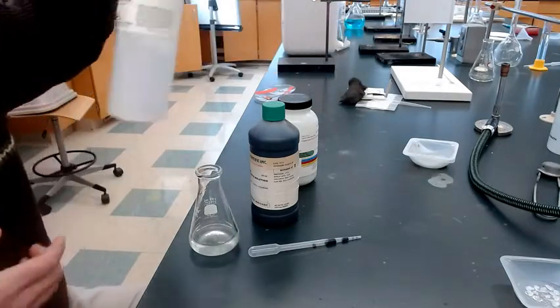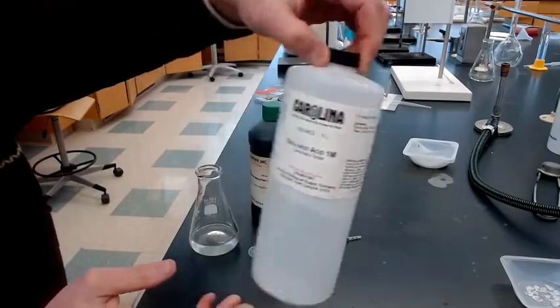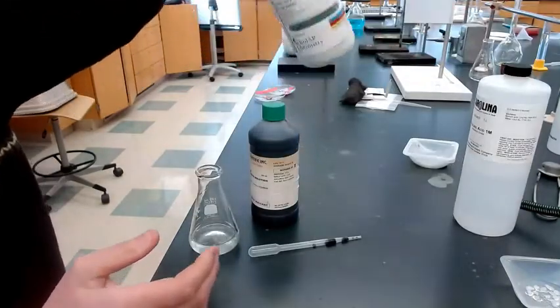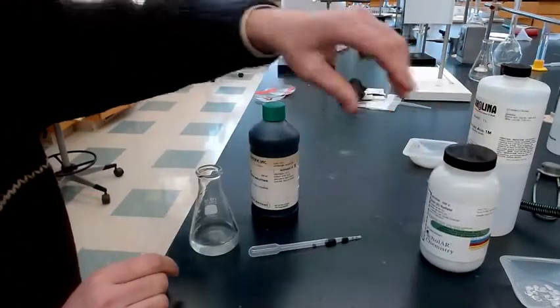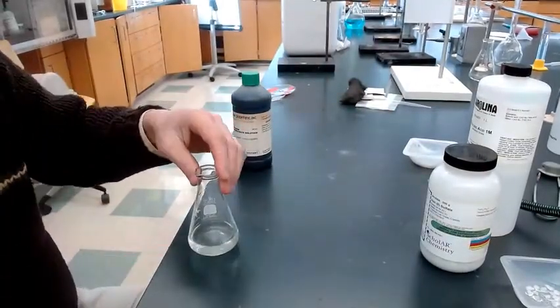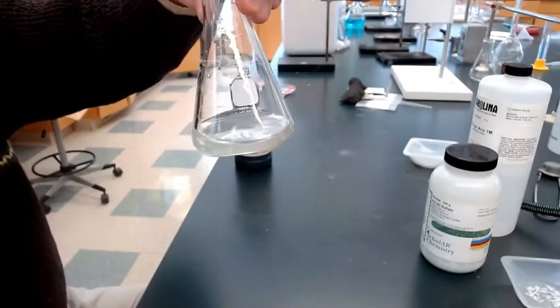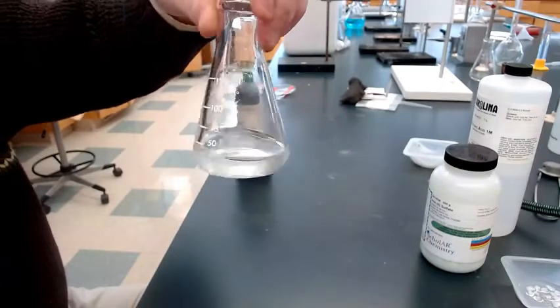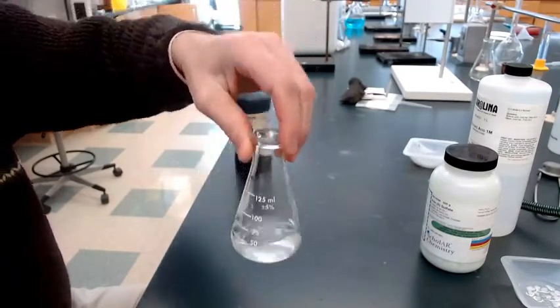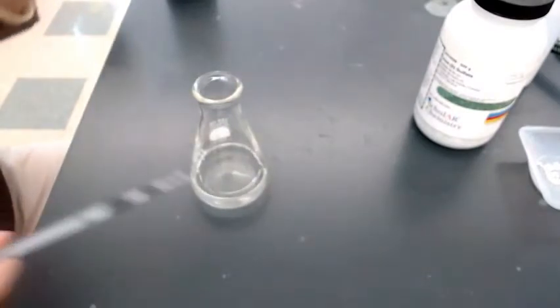So what I did was I took some sulfuric acid and some iron 2 sulfate, and it's solid. I dissolved the two together, and I have this solution of sulfuric acid with some iron floating around as ions and some sulfate. I'll get this a little bit closer in a second, and you can kind of see down. So it's a clear solution.